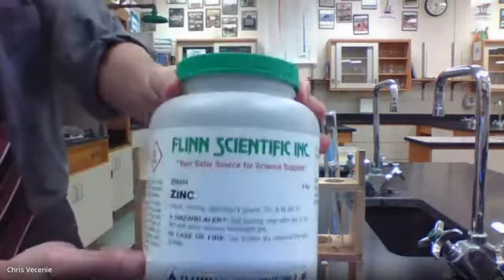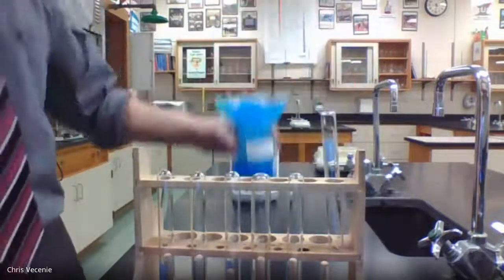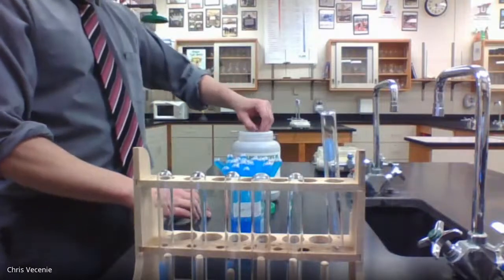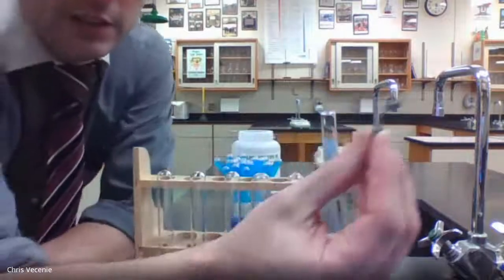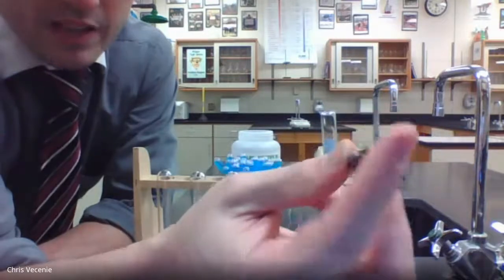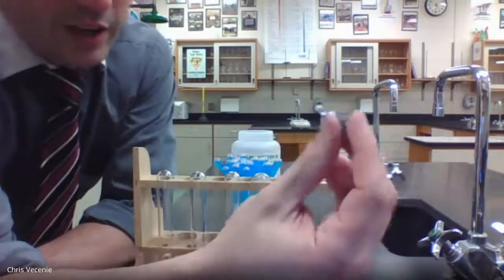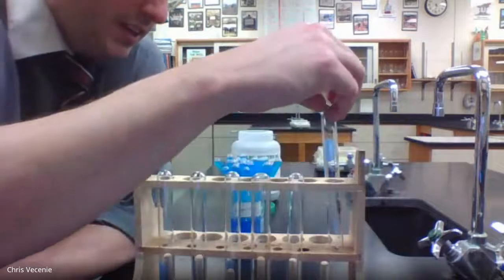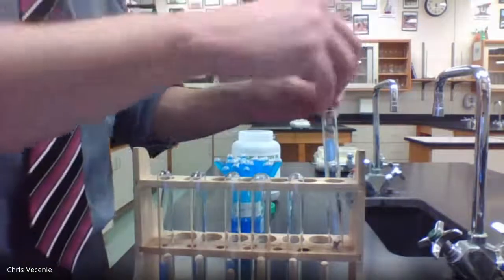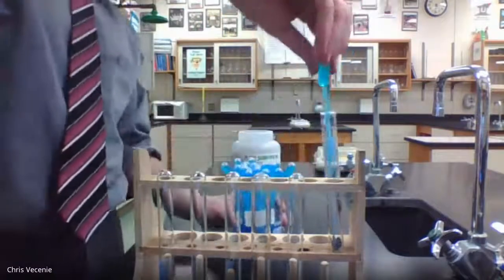Here's my zinc. Here's my copper II sulfate. The zinc you would find is just a metal, perfectly okay to touch with your hand. It has a little bit of gray tint because when the air reacts with it, it gives it a little coating of zinc oxide. But no big deal. I'm going to drop a piece or two down into my test tube.